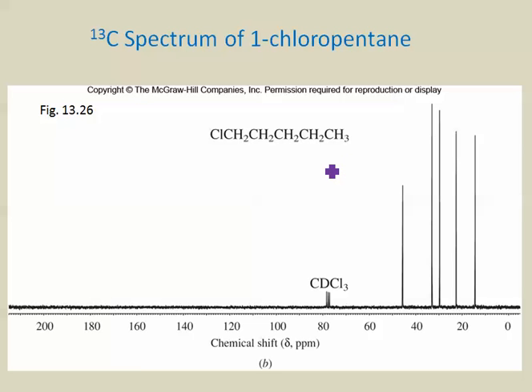We often do carbon-13 NMR on the same instrument that you would do the hydrogens, and so we're using the same sample, the same solvent. This is the deuterated chloroform that we would use as a solvent for a lot of NMR studies, and the carbon in chloroform gives a signal around 77, and it actually is split into 3 signals, and that splitting is due to that deuterium. We don't have any splitting of signals between carbon-13 and regular hydrogen, but the deuterium in this solvent does give rise to a splitting there, although it's a different kind of pattern because we're getting 3 peaks even though we only have the 1 deuterium there.